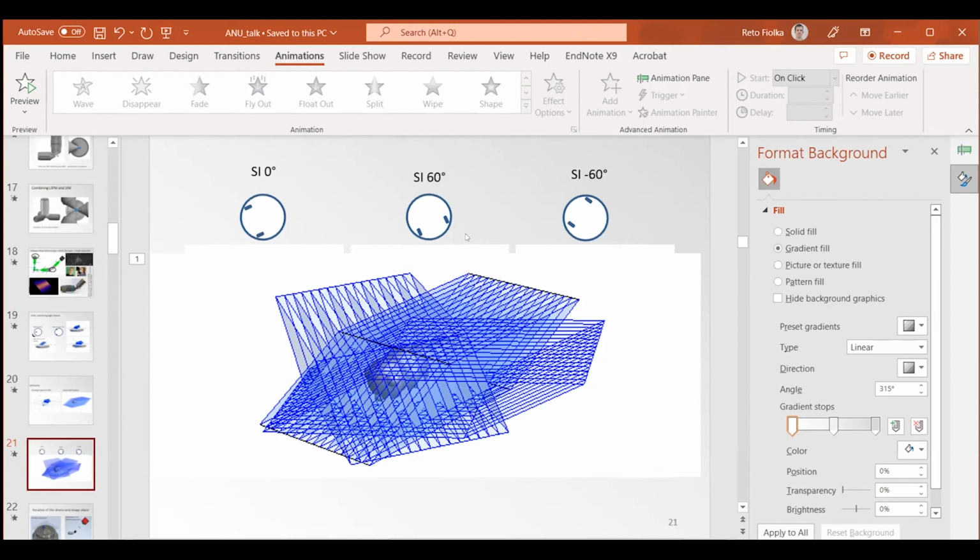So the beams don't disappear or in one direction all of a sudden change the tilt. If they moved a bit inward, then the plane would be differently tilted, and we can observe with some test samples that the waist of the light sheet stays where it should be and doesn't tilt relative to the tertiary. So I think it's manageable. You could build a TIRF SIM microscope with that rotator if you would want.